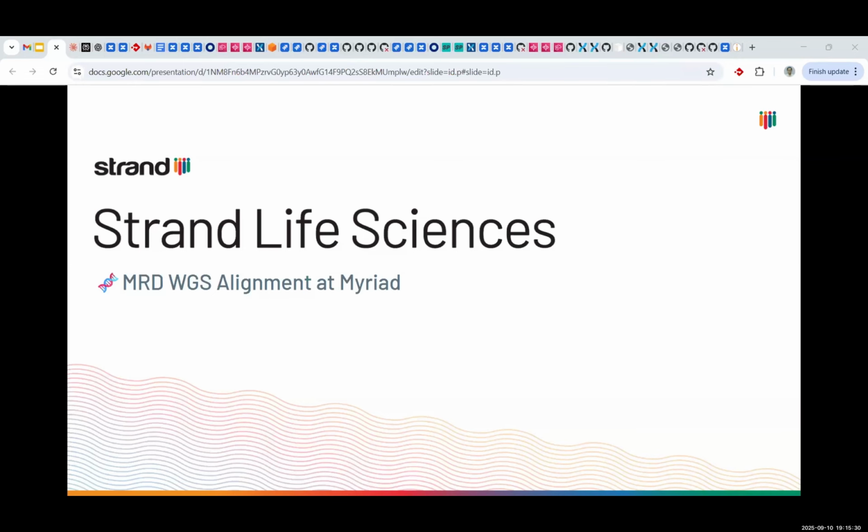Hi everyone, this is Malika, and I'm going to continue on what Benjamin was talking about. Today, I'll be walking you through a journey of building and automating this whole MRD WGS alignment pipeline at Myriad, that is the whole genome sequencing pipeline. We'll take a look at the complete process overview, the challenges which were faced, the solution we built, and the impact it had on cost, scalability, and automation.